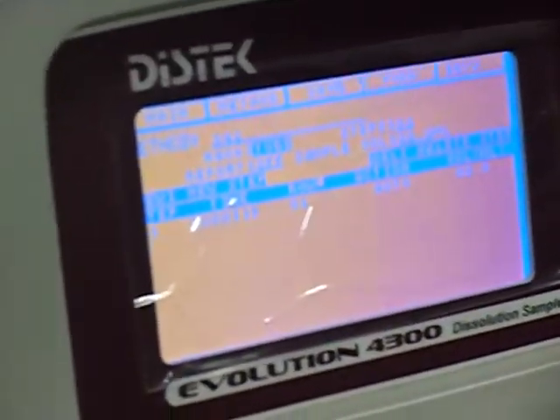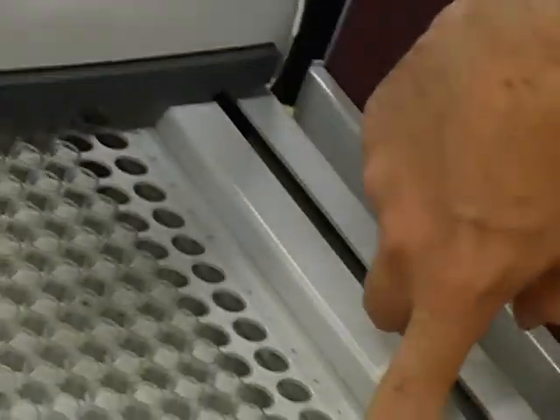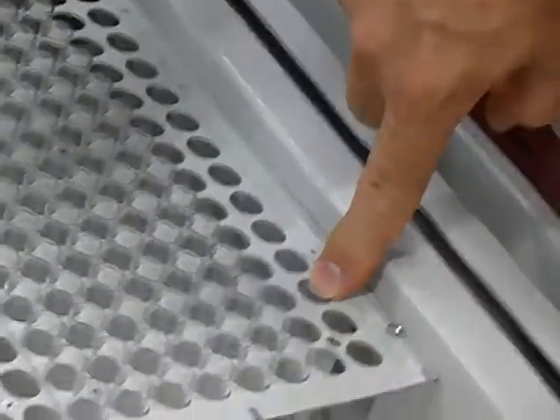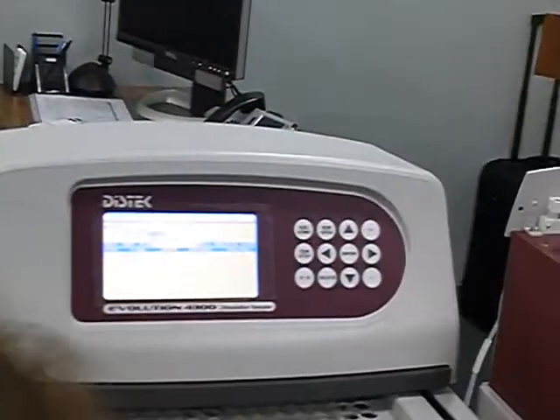This is where you're going to see a difference where it says tube or vial. This is going to dictate how far down those needles are going to go. So if you forget you have this thing set for tube, but you're doing, say, a 1 ml sample in a vial, it's not going to bring the needles down far enough so that the air, when it pushes through, it may just puncture, and that's it. What's going to happen is that's when you're going to tell is when it has blow up on your vials. That would be one of the things to check. But go ahead if you want to.